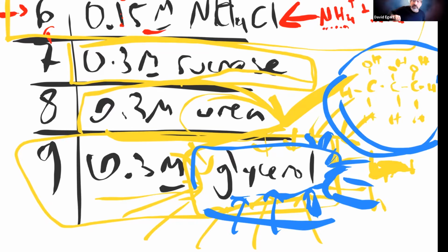If it goes in slowly and you put the cells in and spin them down, they're all cool. If they sit there, feeling more and more and more, oh man, I popped, and then eventually you spin everything down, you'll notice a bunch of lysed cells. Does that make sense?